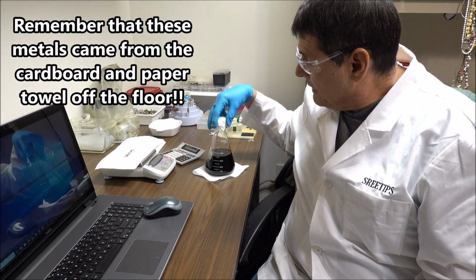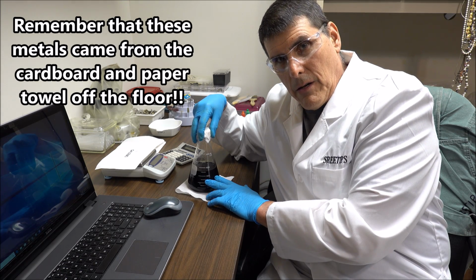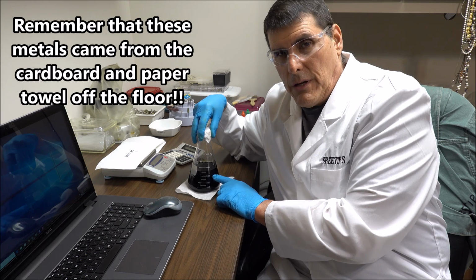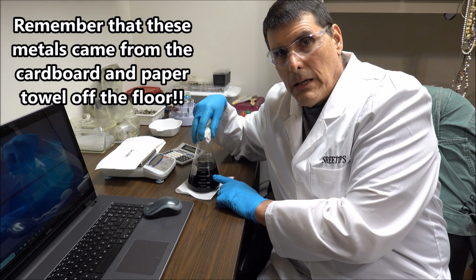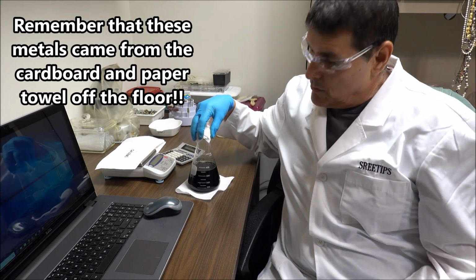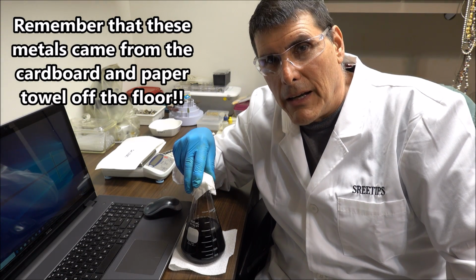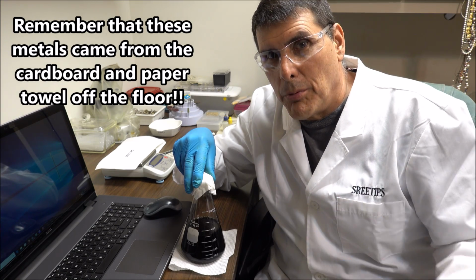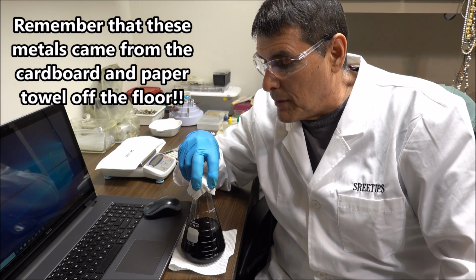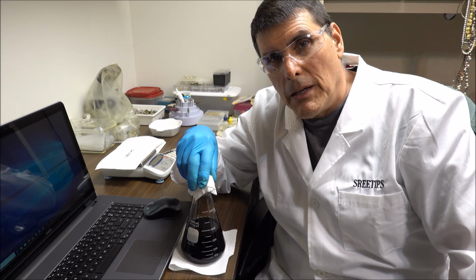The other thing I have here is the palladium in solution. And what we'll do with this is going to take another video to get this done. What I'll have to do is bubble chlorine gas through this with a chlorine gas generator, and it will form a compound of palladium that is then soluble in ammonia, and I'll dissolve it in ammonia and then filter it out and then reacidify it with hydrochloric acid like I've done in my previous videos with the palladium. And then we'll get the pure palladium salt out of that process, and we'll melt that up into a nice button and offer that for sale on my eBay store.